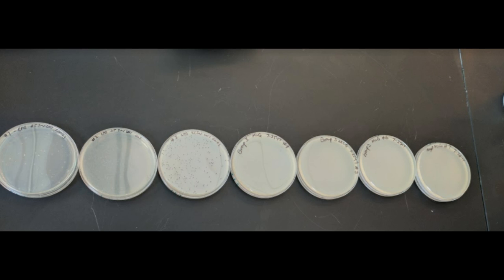The next time you come into the lab, you're going to count the plaques on the plate. A plaque is a clearance. When it looks all fuzzy, like these ones over here, this is called the bacterial lawn. That fuzziness is 100% covered with microbes. But a plaque is a clearance. The plaque is the virus, and it's showing us how much space was contaminated such that the bacteria could not grow in there.